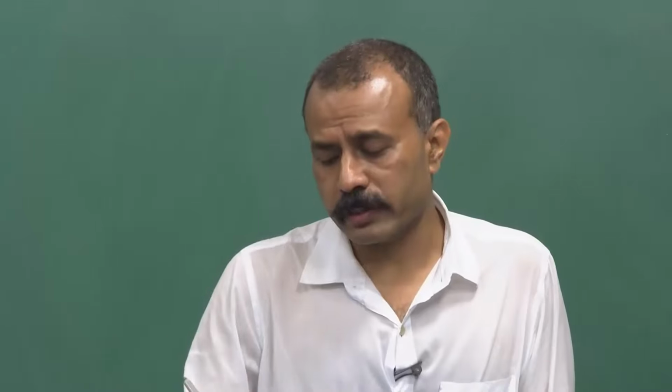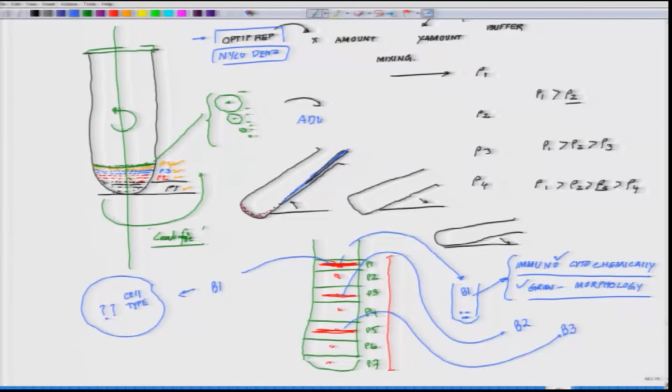As of now, in terms of the OptiPrep separation, what all has been achieved. These are some of the literature I will be giving you. You can separate out the adult hippocampal neurons. Now you remember where we left last week, and I told you I will come back to that: adult hippocampal neurons, and this is where we will be referring to Brewer's work, Gregory Brewer's work. This has also been achieved for adult spinal cord neurons. There I will be referring to James J. Hickman's work. His group has pioneered these techniques.